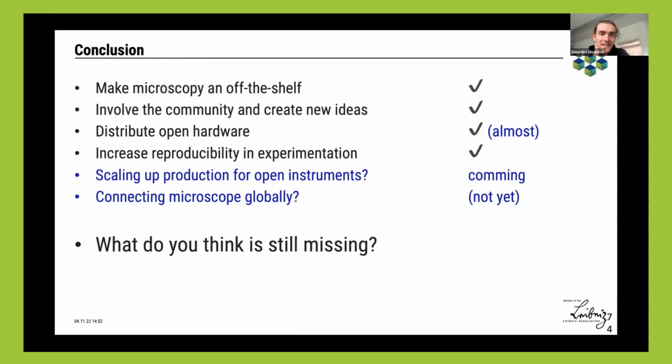So to summarize, yeah, did we make microscopy an off-the-shelf tool? I hope yes. The community aspect is definitely important, and we have to maintain that. Distributing hardware, that's something on our list, and something that's not really on there yet, but I'm super keen to do that, is connecting all the different instances of microscopes.